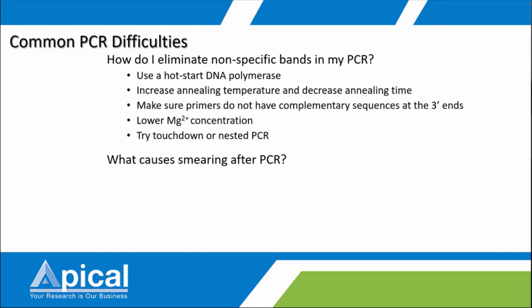Also ensure the proper casting of your agarose gel. You can check this when you run the DNA ladder, to see whether your DNA ladder is smearing or not. Only then do you look into the PCR itself.